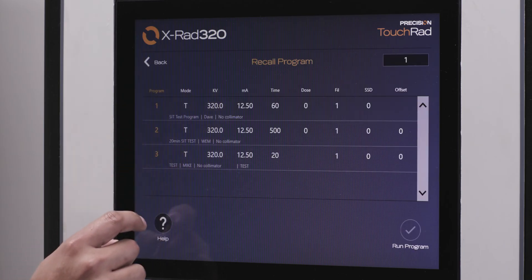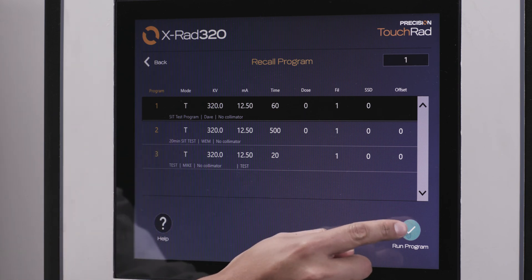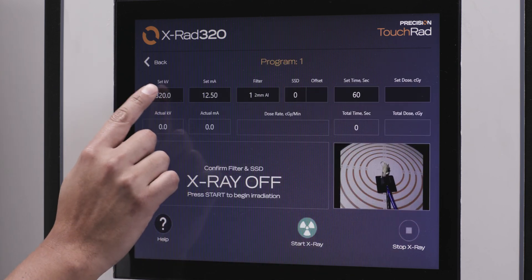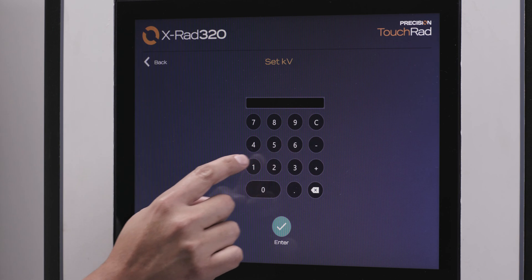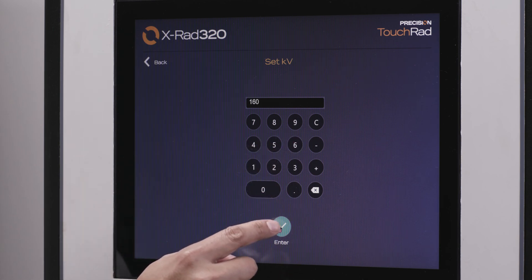Equipped with a simple, intuitive touch-screen control panel, users can easily adjust parameters or select from pre-configured settings with a one-touch recall to start a procedure.